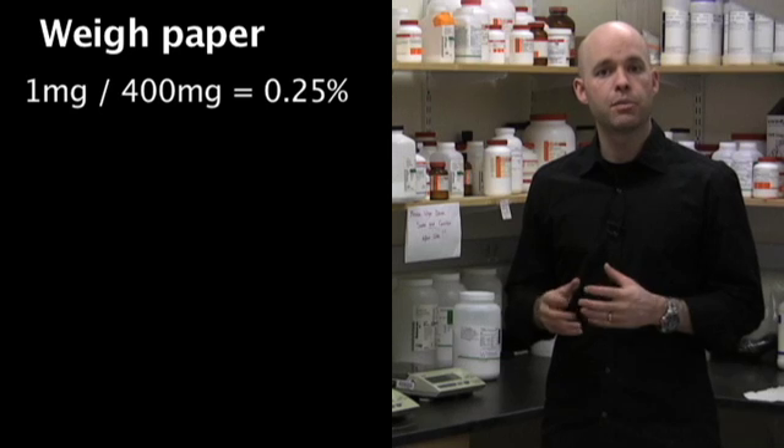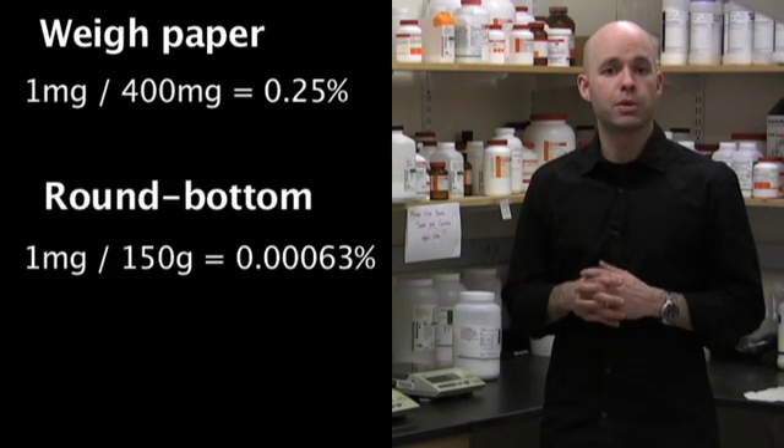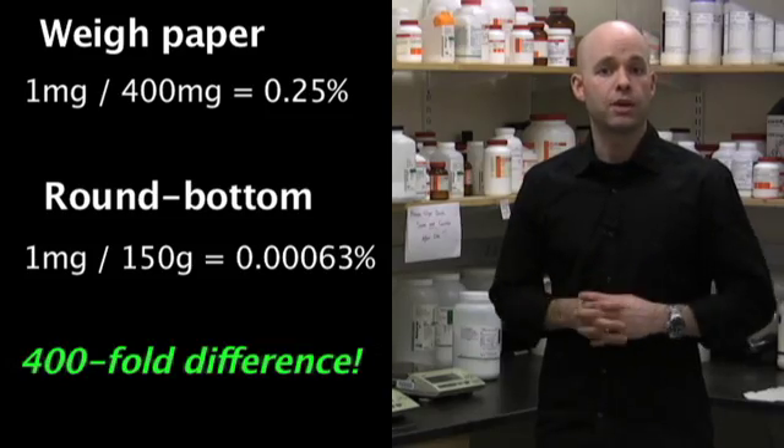If you contrast this with something like a cork ring and a round bottom flask, that's going to be much heavier. So we need to consider when weighing something out how much of a difference in that total absolute weight we're actually going to make. It's pretty clear that percentage-wise, one or two milligrams will make a much bigger percentage difference on a piece of weigh paper than they would in a round bottom flask.